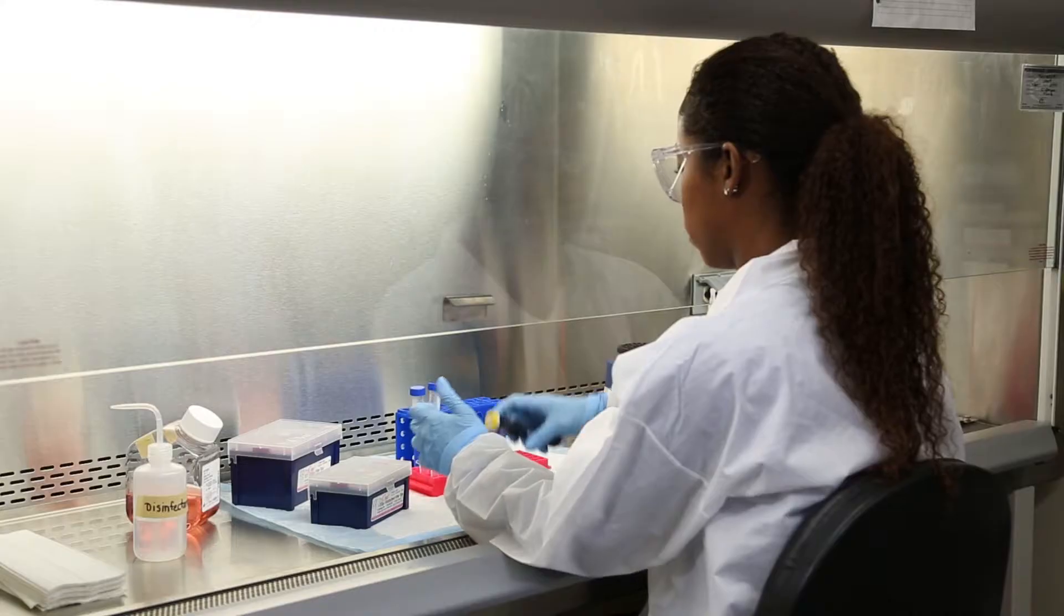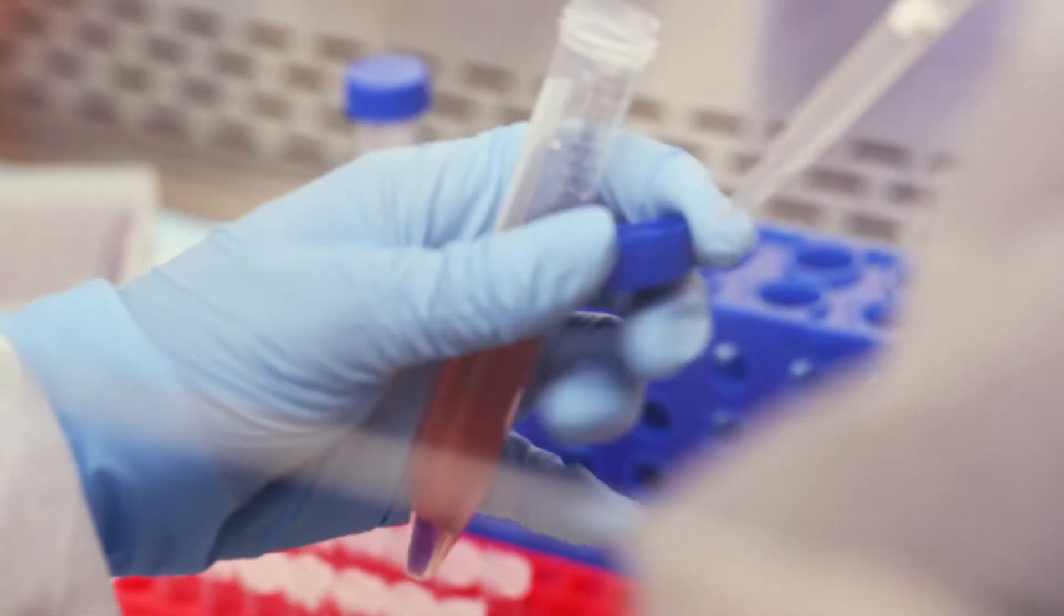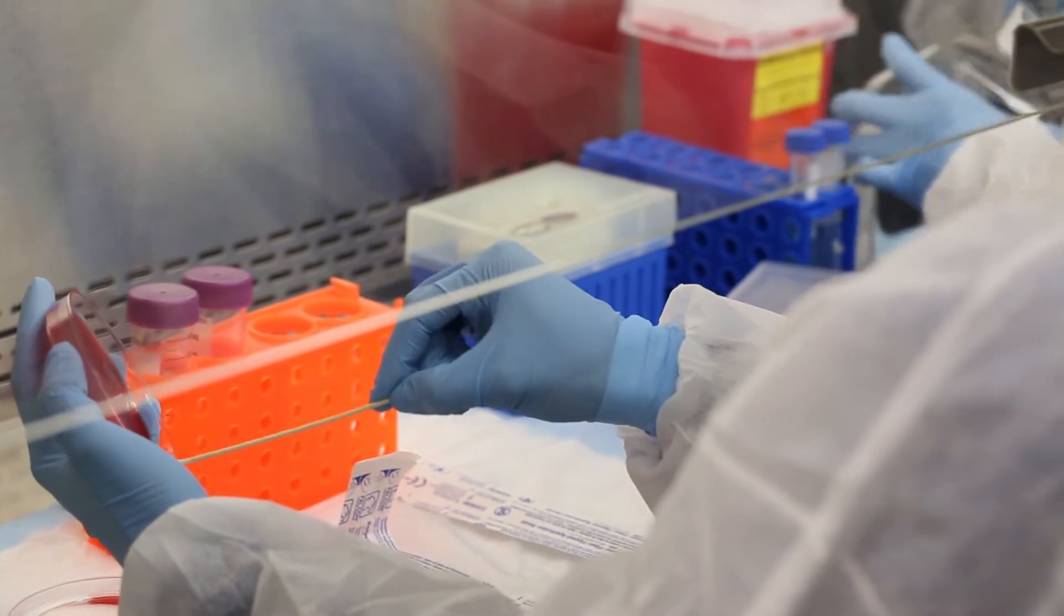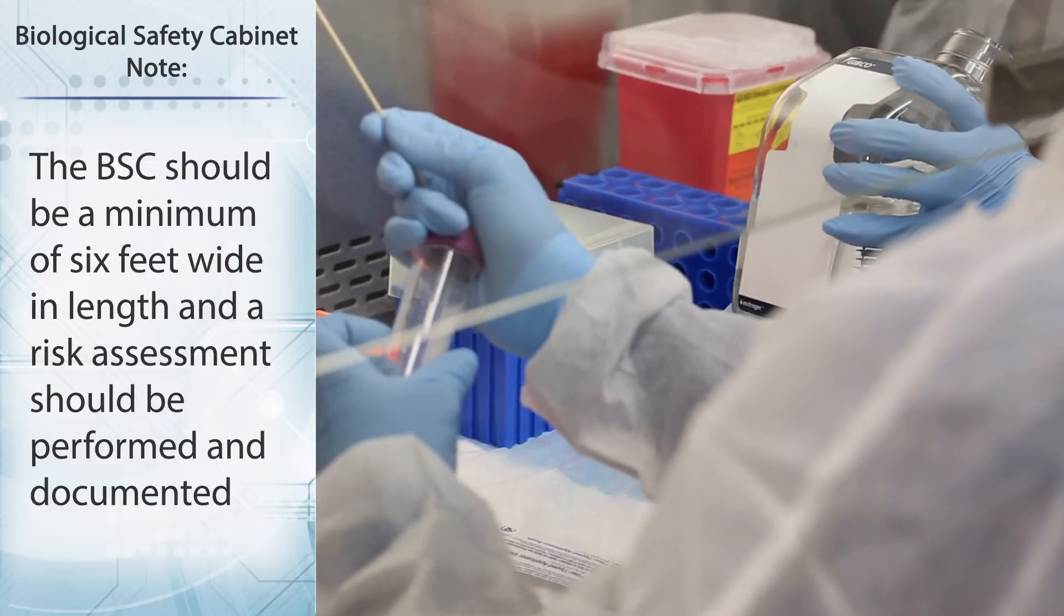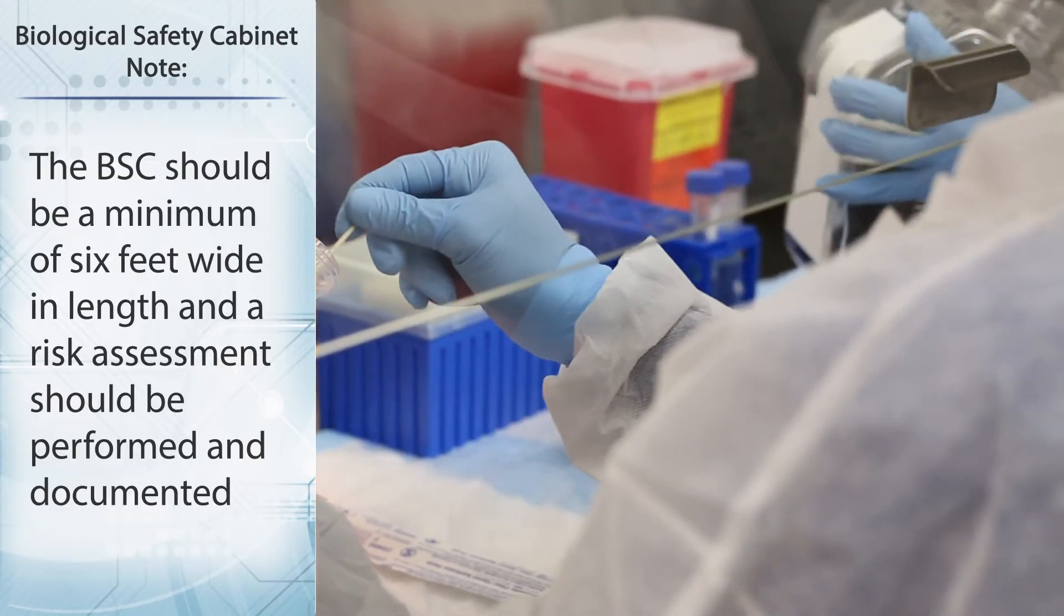Items should be placed as far back in the cabinet as possible without blocking the rear grill. While working in a BSC, you should be seated and only one person should work in the BSC at a time. If two people need to work in the BSC at the same time, the BSC must be a minimum of six feet wide in length and a risk assessment must be performed and documented.